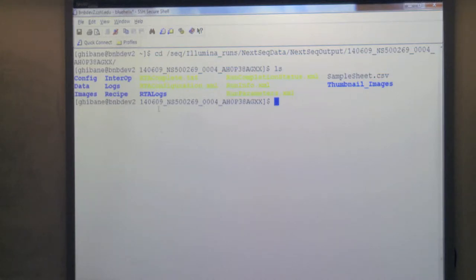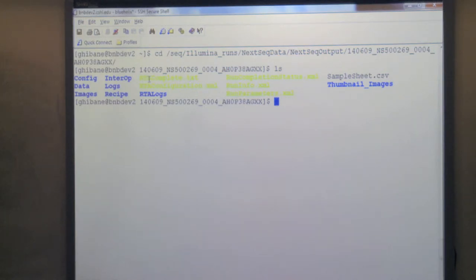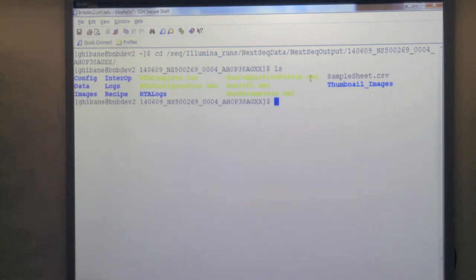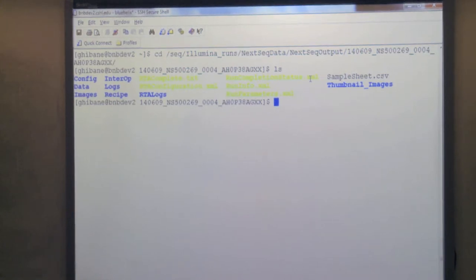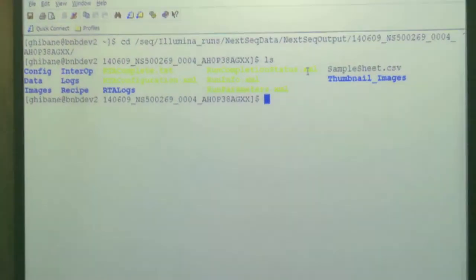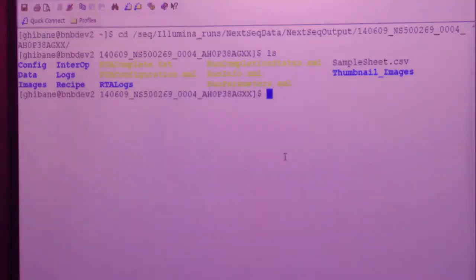The files we look for to confirm run completion are the RTA complete text - which stands for Real Time Analysis, one of the softwares running on the instrument doing the base calling. If this is completed, the run is completed. There is also a file called run completion status XML. If that is there, the run is complete; it's a status file confirming completion. At this point my run is completed.